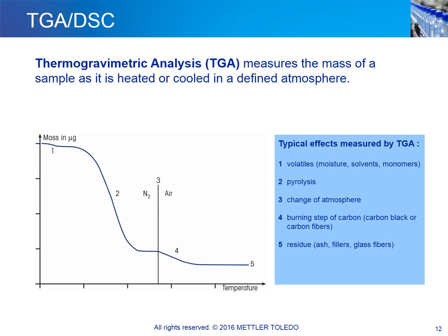Now let us turn our attention to thermogravimetric analysis, or TGA.